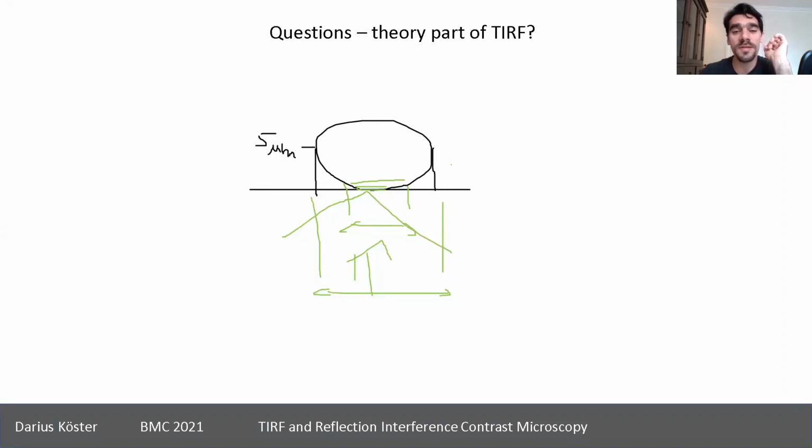I have to admit, there can also be problems. So if you use beads, some beads can be a problem, that somehow the light that goes in here also reflects around, and then you get a bit larger halo. But this is sort of the way you can go about it. And otherwise, if you have something like a vesicle, so something that's empty inside and only on the outside some fluorophore, that would be a much better sample as well.